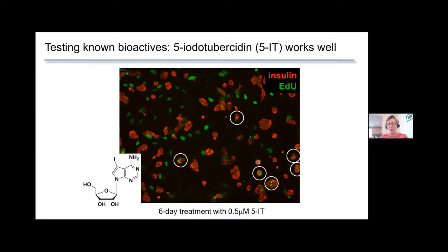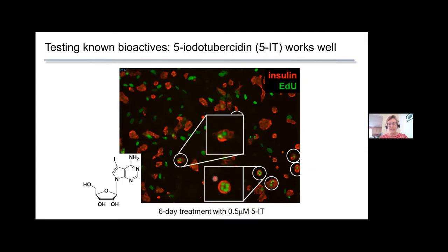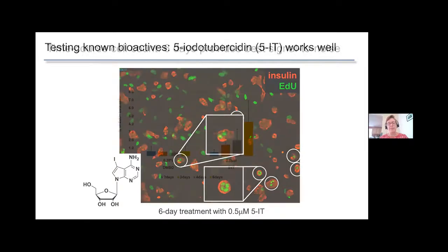And what we found was that we saw very strong upregulation of these green nuclei, and even found things like quadruplets of nuclei together, which to us felt like, wow, we're really watching. We believe we're seeing cells that divided, or at least nuclei that divided.